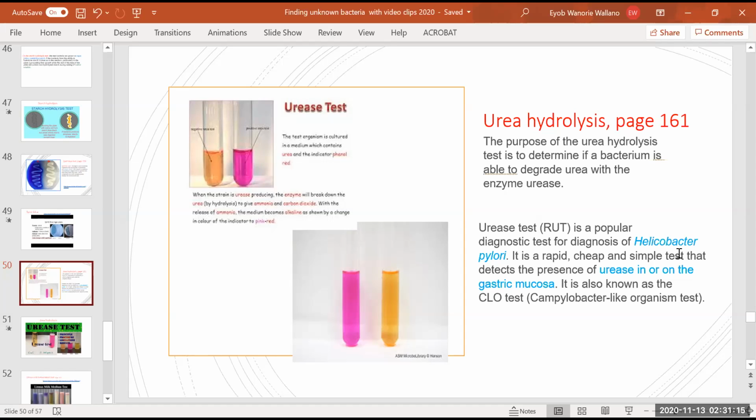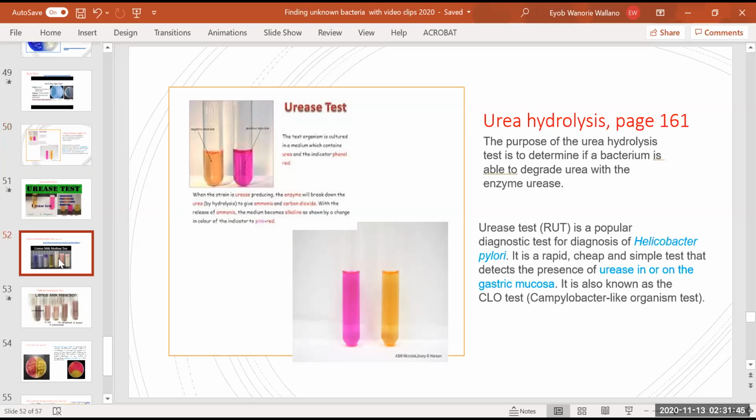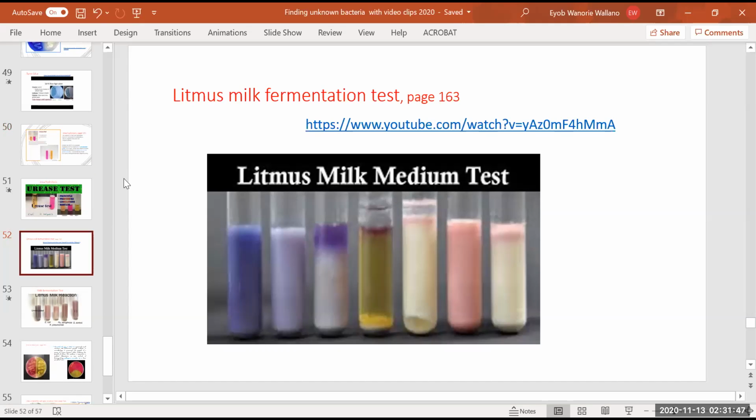You see, this is mostly a water contaminant bacteria. Some kind of water you drink, or some kind of food, like fresh fruits contaminated with bacteria, and then you can be infected. We call it Helicobacter because it looks like a helicopter in shape. It doesn't have a uniform shape, but we call it Helicobacter. Now it is going to change the media into a cherry or purplish color. You see, it's a very interesting bacteria, really. I am not going to use that video.